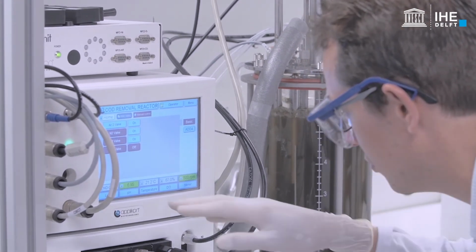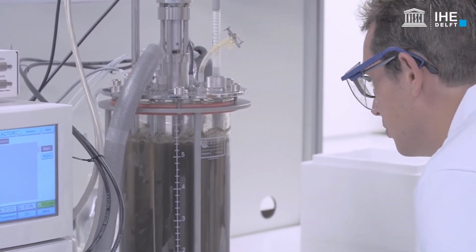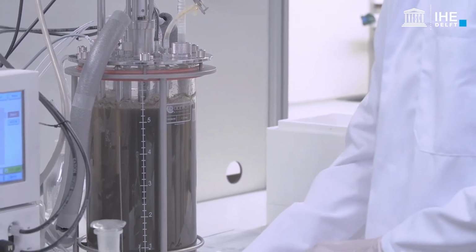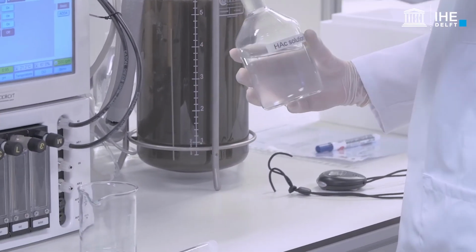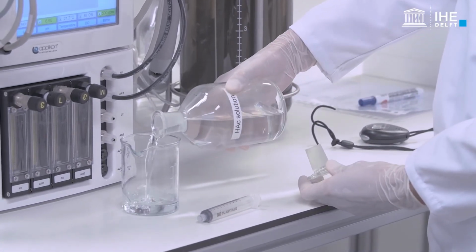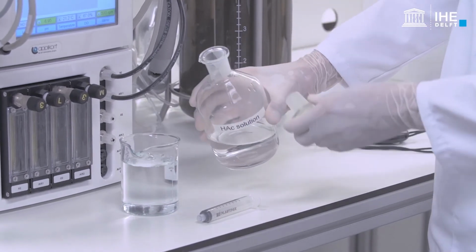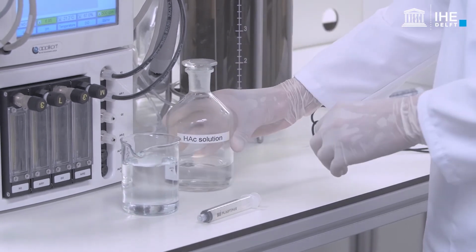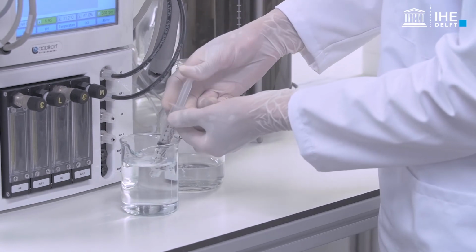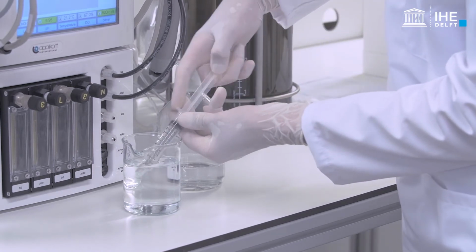Prepare the addition of the carbon source of interest. Collect the required volume of the carbon source to be added in a syringe. Avoid any presence of air bubbles.